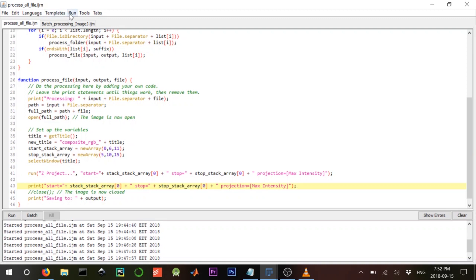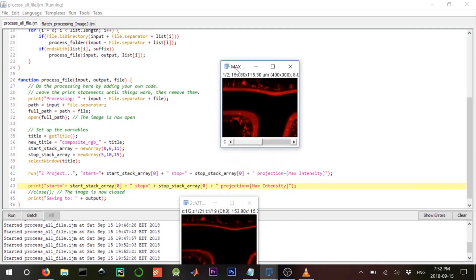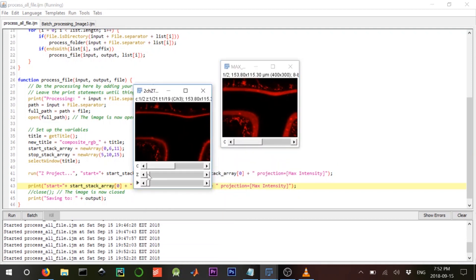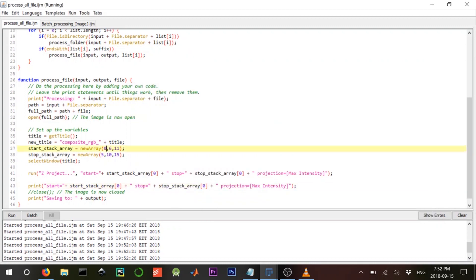Looking at the log, it says 'start=0 stop=5 projection=Max Intensity' — this is the command we gave to run. Start at index zero equals zero, stop at index zero equals five. So what we need to do is run this three times to create three different z-stacks in one shot.